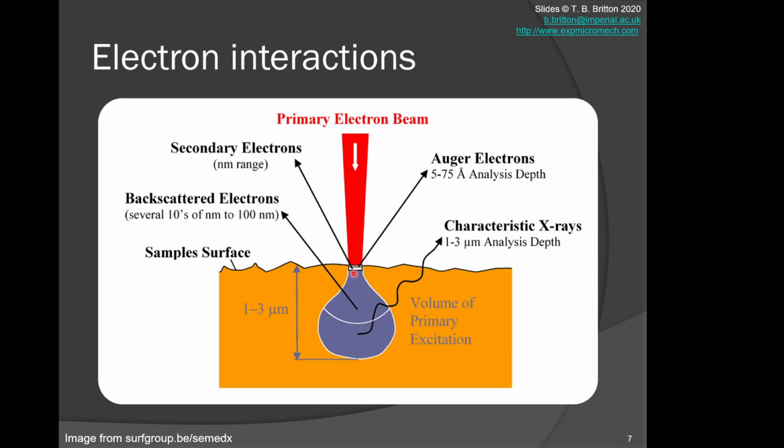When we scan our electron beam across our sample, we talk about the characteristic signal that we detect. Broadly, we input a focused probe, often a convergent focused probe of electrons, onto our material. That is a high energy probe that is highly penetrating into our bulk sample. The signals that we can characterize include a low energy signal associated with the promotion of surface electrons from our sample. Those very low energy promoted electrons can escape and be attracted and collected, and they're called the secondary electrons. And that's the common imaging mode that we'll often use in the microscope.